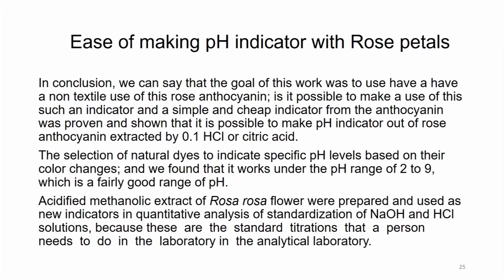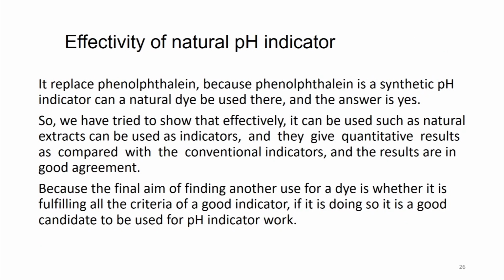Acidified methanolic extract of Rosa rosa flower was prepared and used as a new indicator in the quantitative analysis of standardization of sodium hydroxide and HCl. Because these are standard titrations that a person needs to do in the analytical laboratory, and this was proven by us very effectively.